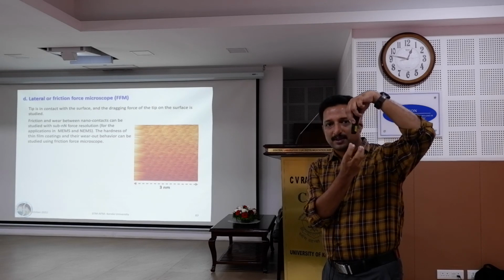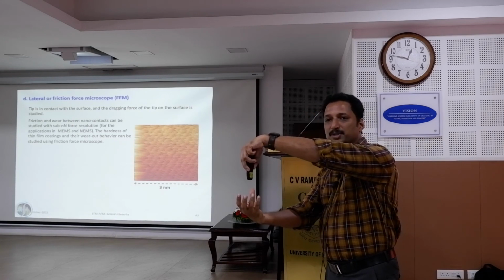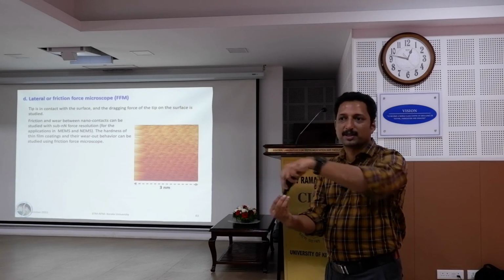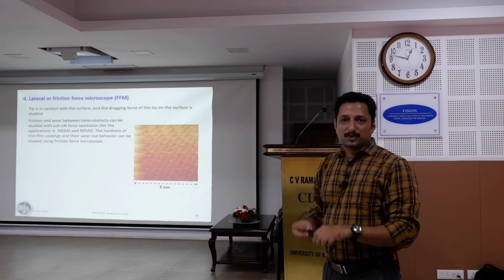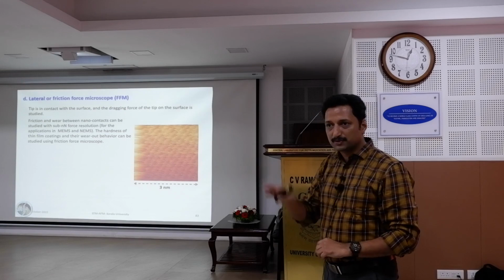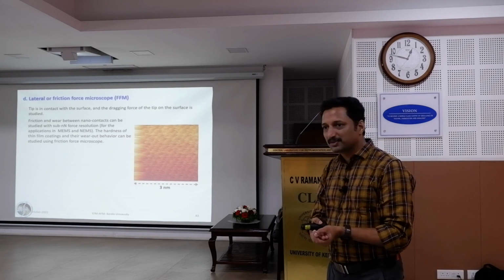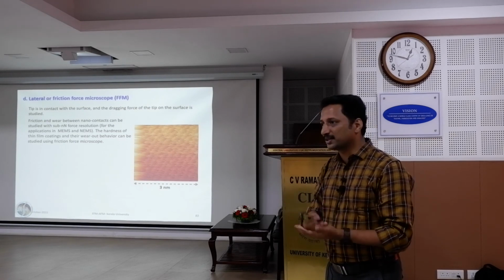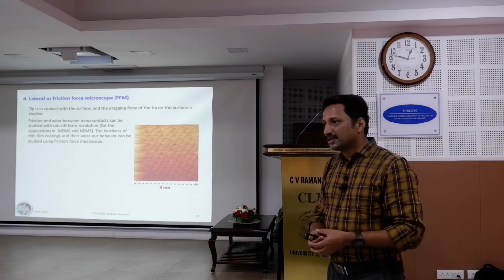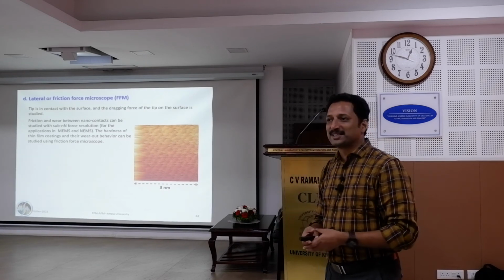Okay, and then go to your antibody, and if you measure the force, with how much force the antibody and antigen interact with each other, you can measure it. So for biological fields, with AFM you can do force measurements. Basically, why do we measure all these things? Because it tells you how much energy we need to do all these processes in a biological process, how much energy it takes for an antigen-antibody interaction. Okay, I am not a biologist, so if there is anything wrong on that side, please correct me.